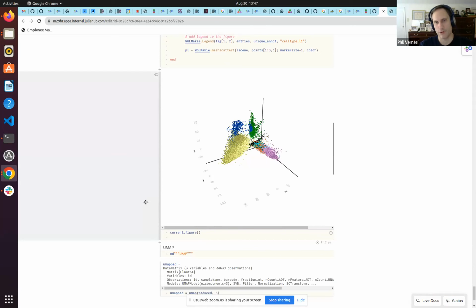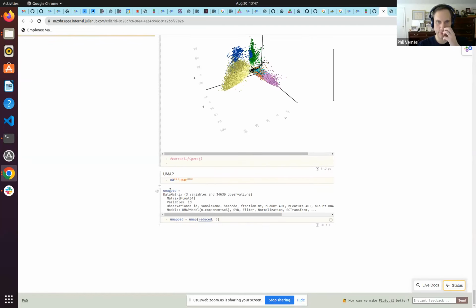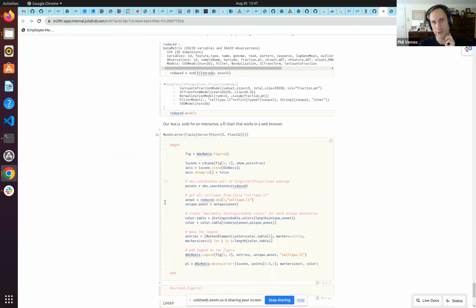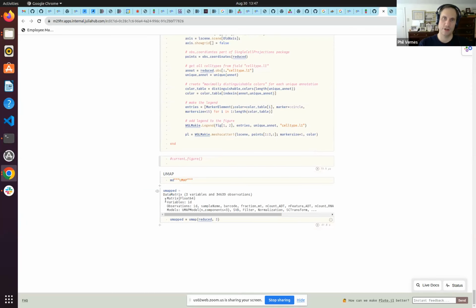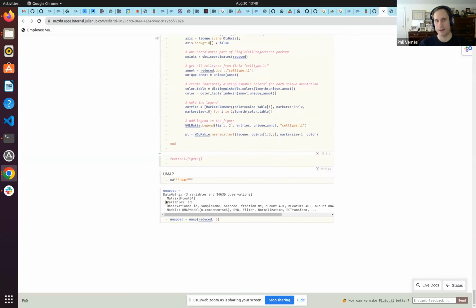I would characterize that as quite nice. Now, there are other options too. I'm just going to suppress that for my browser's sake. I could use this UMAP representation for reduction rather than SVD, and I could plot that clustering. That's another option. You can use TSNE clustering. There are a lot of options, and I could use all of these for plotting. So you have a variety of options with respect to clustering methods for the plotting.